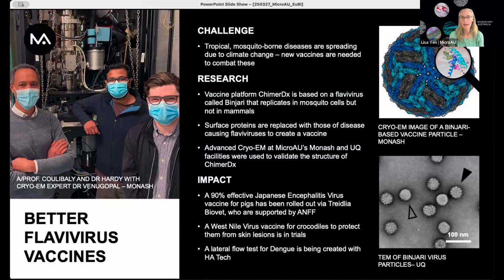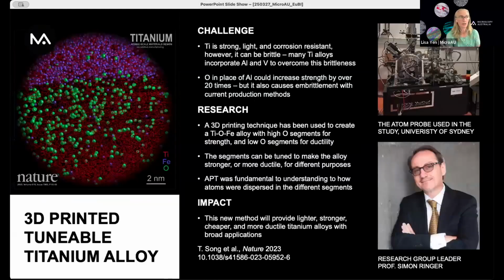And so looking at ways that we can help people understand how revealing that structure really does lead to those developments being possible. So of course, because of our varied backgrounds, we also look for ways to demonstrate those for materials. So this is looking at 3D printing techniques. And so again, it was nationally significant research infrastructure, an atom probe instrument, that was required to be able to do this identification within this titanium alloy.